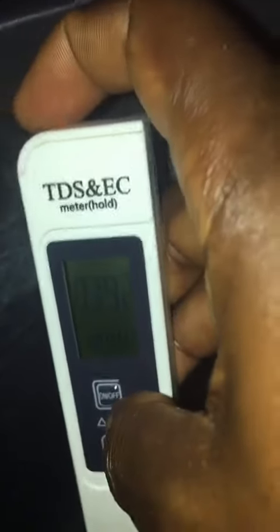Put the meter inside the water again. When it's in the water, press hold to stabilize and capture the EC reading.